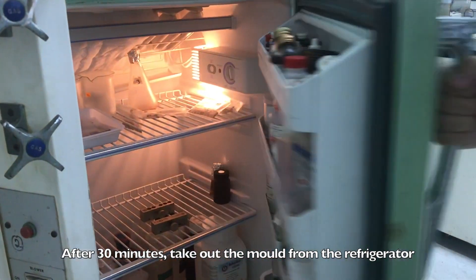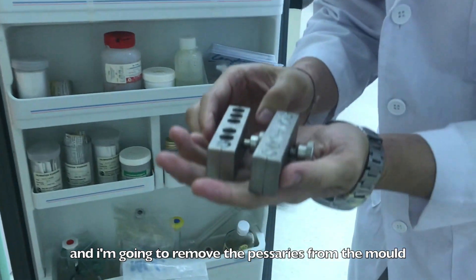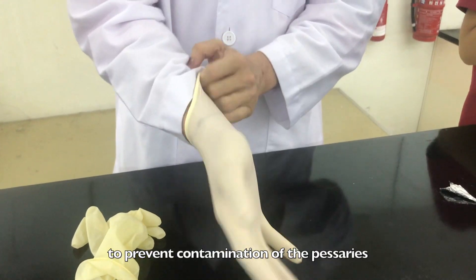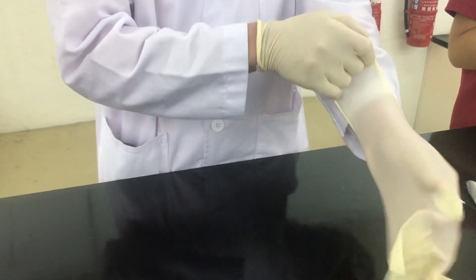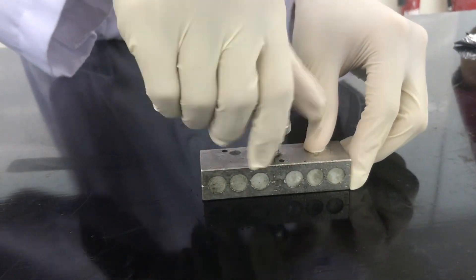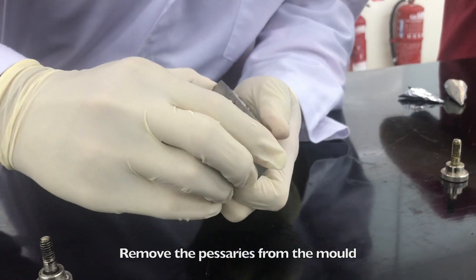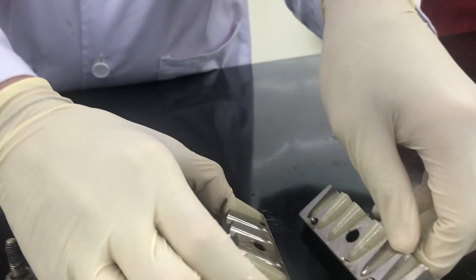After 30 minutes, take out the mould from the refrigerator and remove the pessaries from the mould. I wear a pair of gloves to prevent contamination of the pessaries. Remove the pessaries from the mould — and ta-da! This is how a pessary should look like.